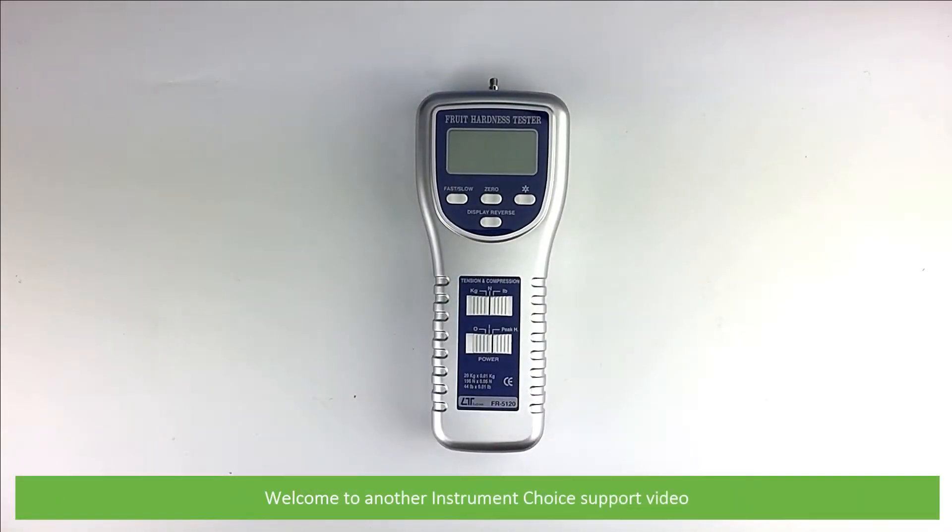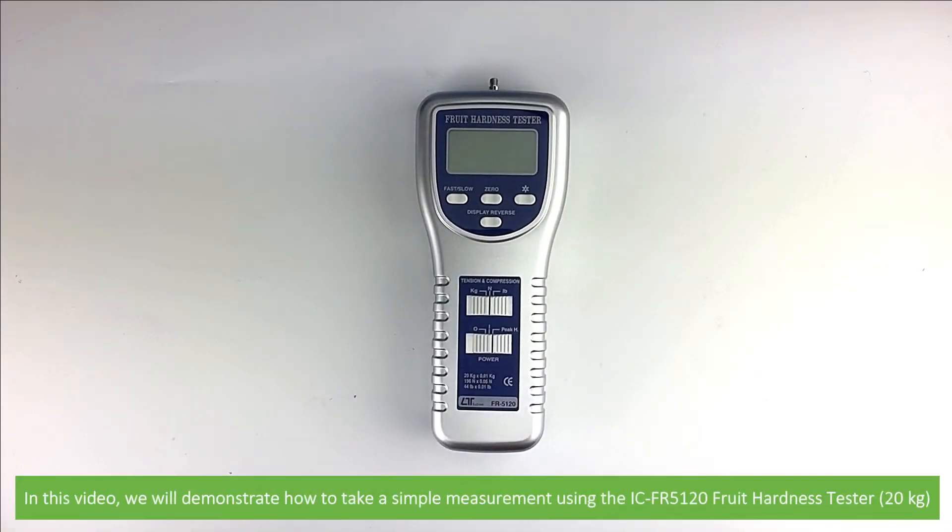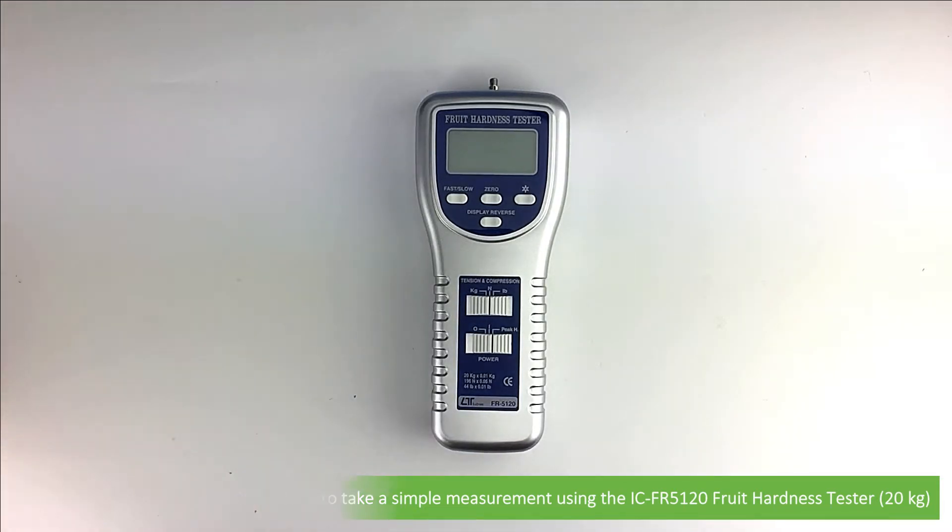Hi and welcome to another Instrument Choice support video. In this video we'll demonstrate how to take a simple measurement using the IC FR5120 fruit hardness tester.